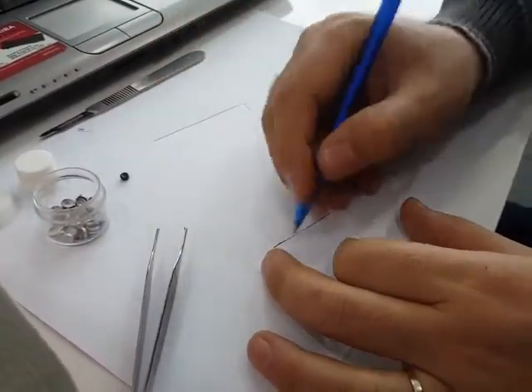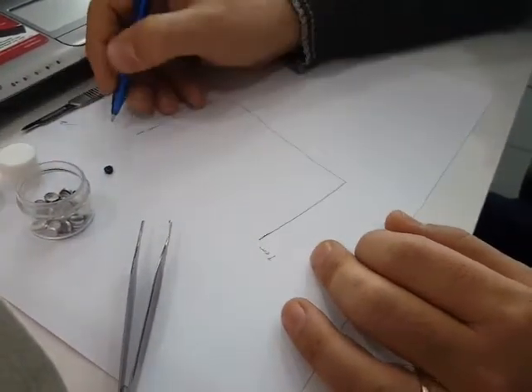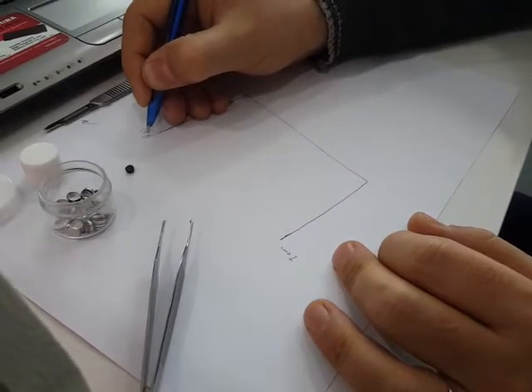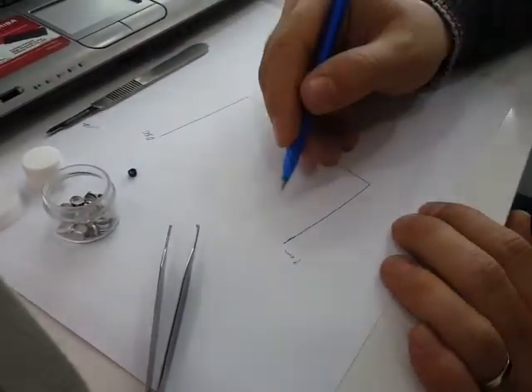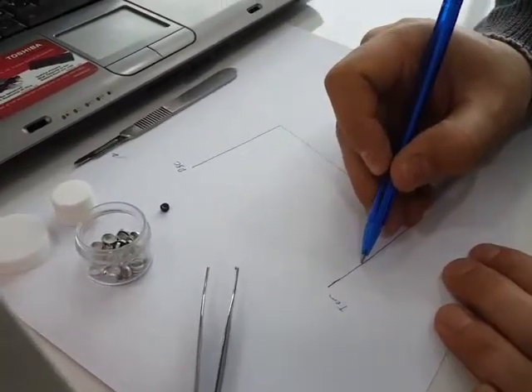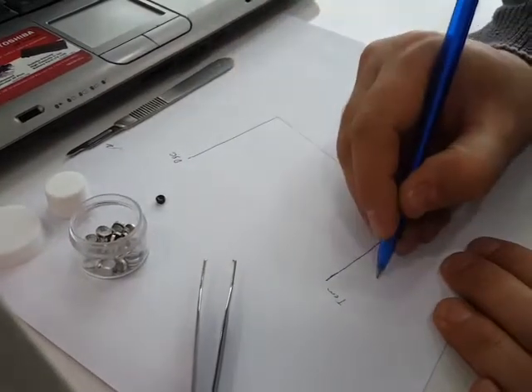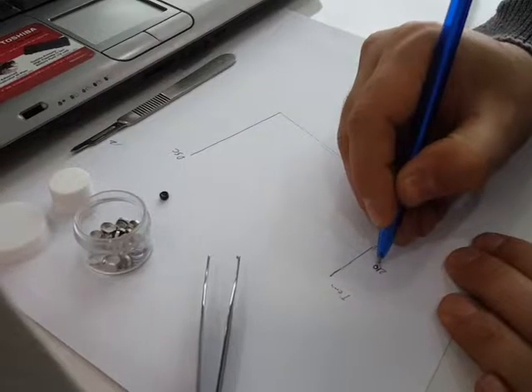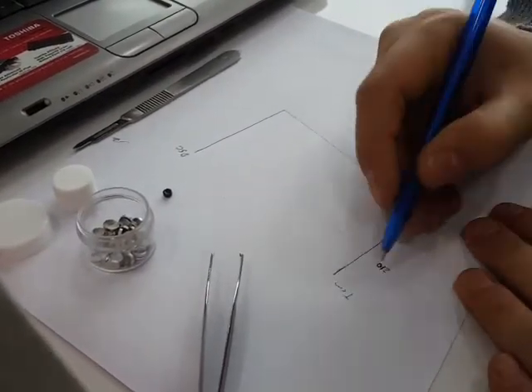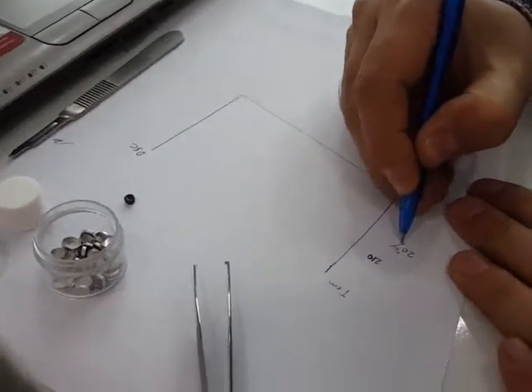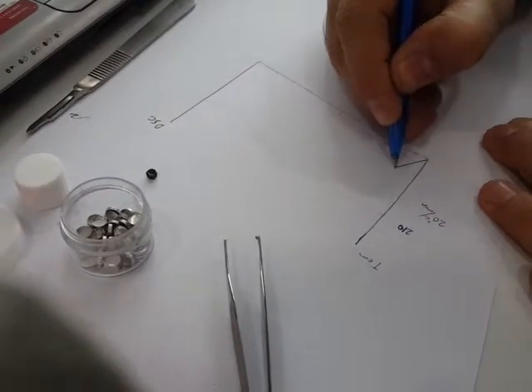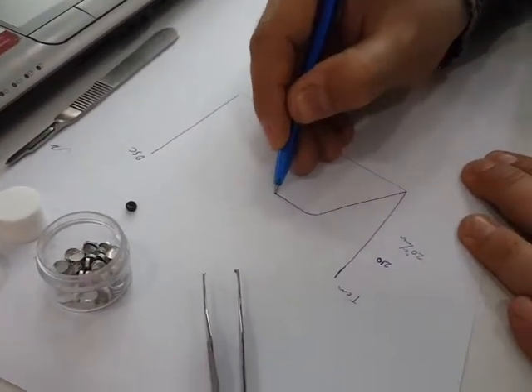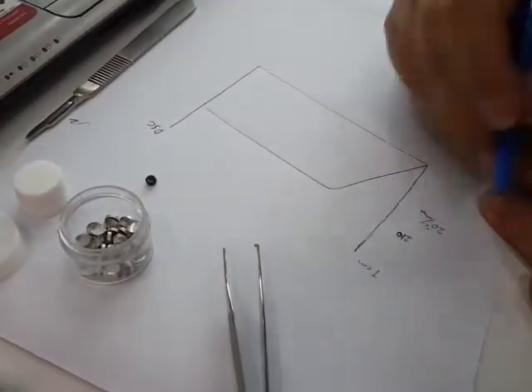Two vertical lines: the first one is temperature, the other one is DSC, the unit of energy. Normally, for example in polyethylene, the operator sets the temperature 200 or 210 degrees centigrade for checking the oxidation induction time in this temperature, and sets the temperature rate according to the standard, 20 degrees centigrade per minute. The temperature will rise with the specified rate to be stabilized at a specified value, 210.